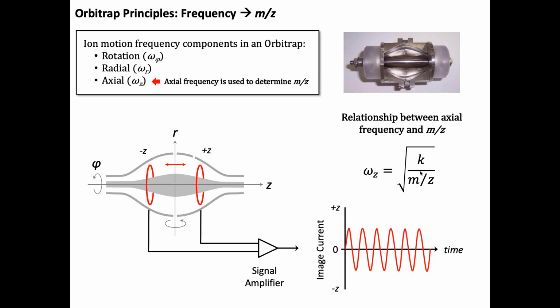So when you have something, let's say a 10,000 molecular weight protein or heparin sulfate chain, all right? You put one charge on it, and it has a certain frequency, a mass to charge of 10,000. If I put 10 charges on that heparin sulfate and I fold it from 10,000 M over Z to 1,000 M over Z, I drastically changed its frequency. And in the same amount of time, I'll get much better analytical performance out of that 10 minus charge state versus the 1 minus, okay? So that's why multiple charging electrospray is so advantageous in FT, Fourier transform-based systems like the Orbitrap.